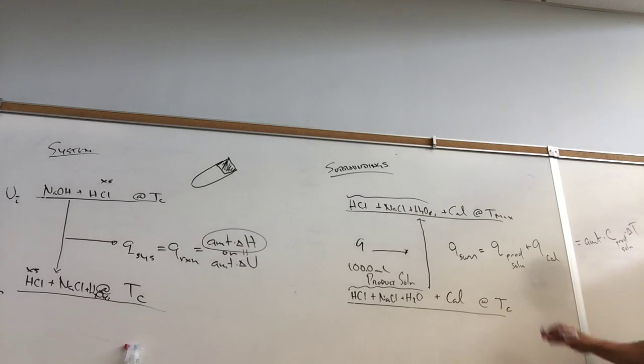And so we're going to do the same deal with the graphs. We're going to monitor the HCl and the NaOH temperature. Hopefully they're pretty much the same, but they might not be. And then at 6 minutes, we're going to mix it. But the initial temperatures here are going to be off. We're going to wait until we see a nice cooling curve and back extrapolate.